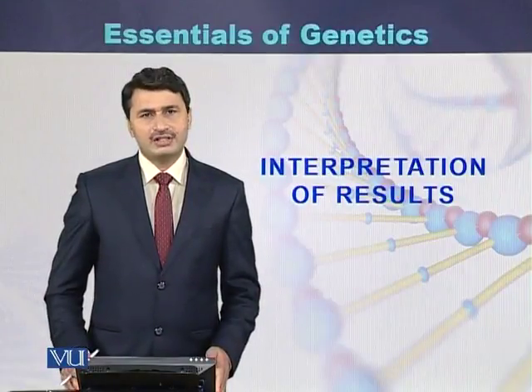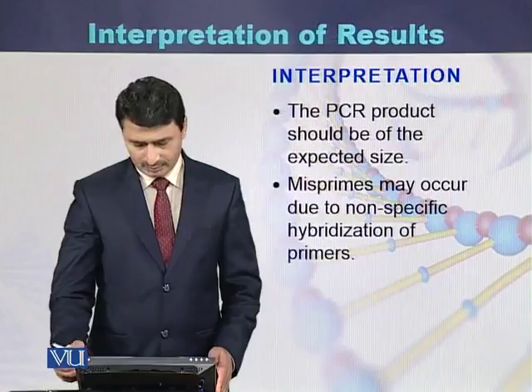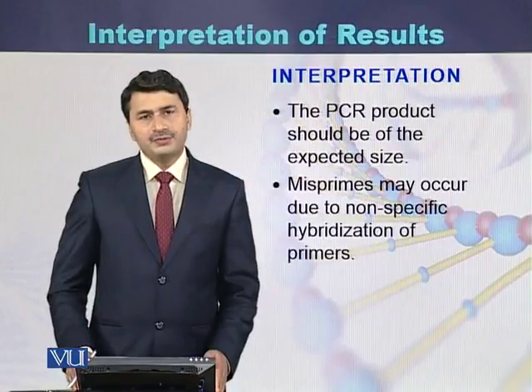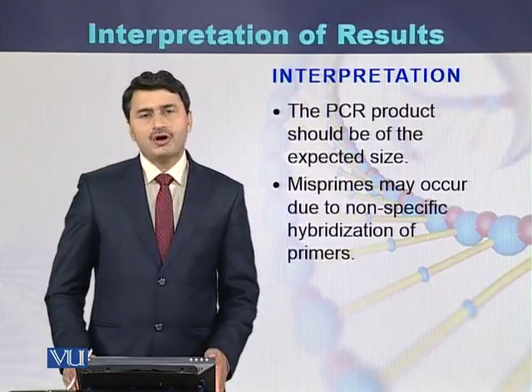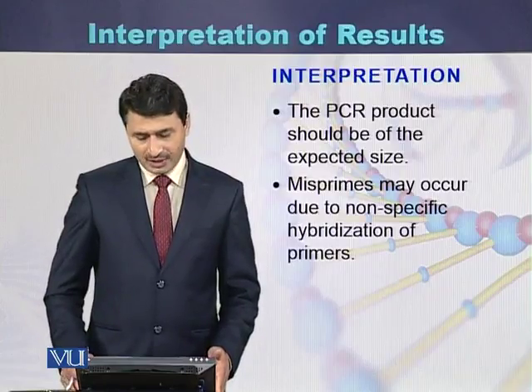Interpretation of the results. During the PCR, the product size should be of the expected size.